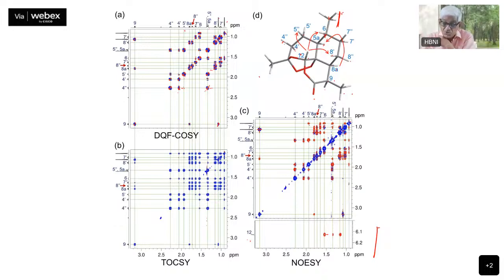So 12 is showing NOE to 3 protons there. 12 is showing to 6. This is NOE. And 12 is showing to 8 prime, and is also showing to 5 prime. So 12 is far away from the others, no? 12 is close to this oxygen. That's why this is shifted down. Then it is attached to 2 oxygens. Therefore, it is quite down, around 6.15 ppm.